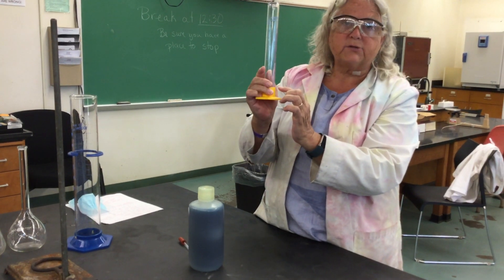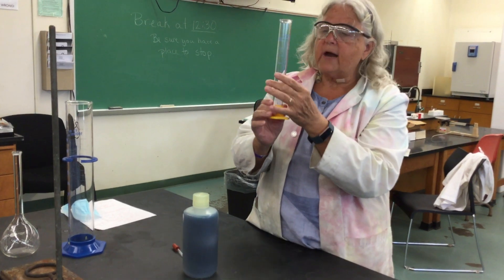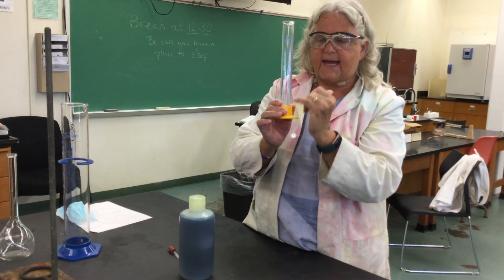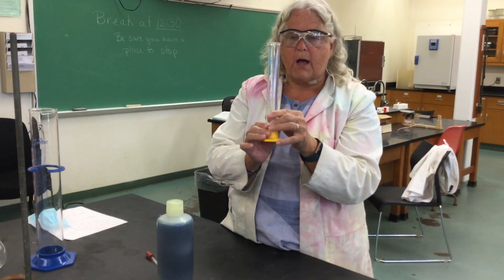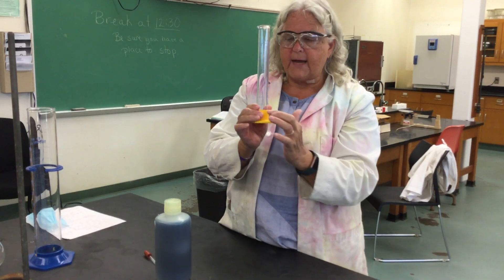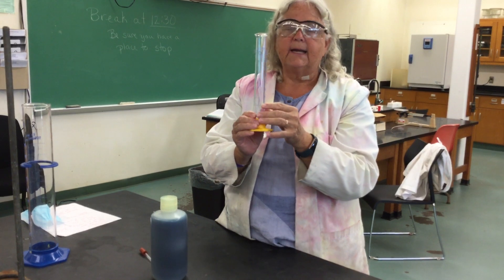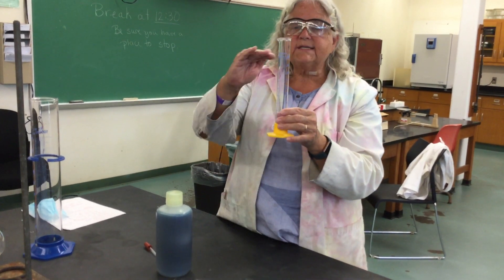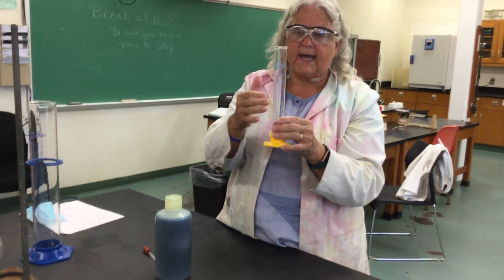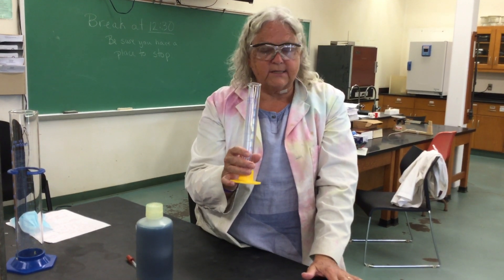There's a little tiny line on the graduated cylinder that is 1 milliliter apart from the next line. Whenever we're using anything that has scaled lines on it in the lab, we always want to make sure that we read it to a tenth of the smallest division. So if my graduated cylinder is calibrated in 1-milliliter increments, then I can read it to a tenth of that, or 0.1 milliliters. When something's resting right on the line — if I filled it right to the top and got the meniscus to rest right on the line — I would say it held 100.0 milliliters.